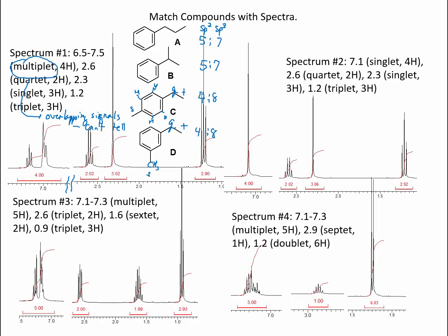Technically, these aren't equal to each other, but a methyl and an ethyl have such a similar effect on chemical shift that we could imagine that they would all come at the same place. Okay, so the first one, we're going to assign to the meta-isomer because there's less symmetry of the aromatic system. This one we're going to assign to the para-isomer, which has greater symmetry in the aromatic system. Notice that the hydrogens at the sp3 carbons look exactly alike in both cases. All right.